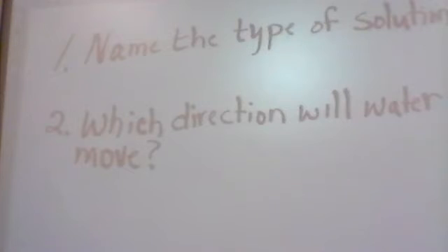Shut your mouth. What direction do you predict that the water is going to move? In or out or stay the same? What was the thing in the sauce?